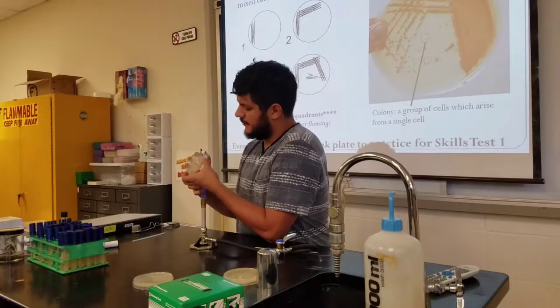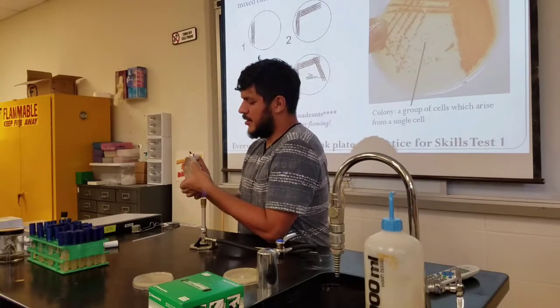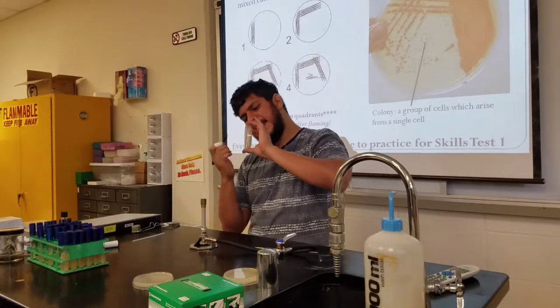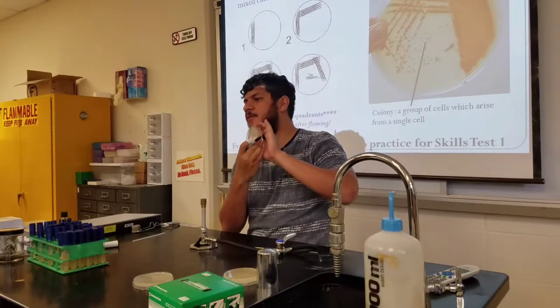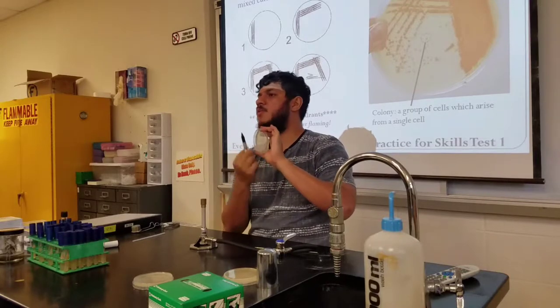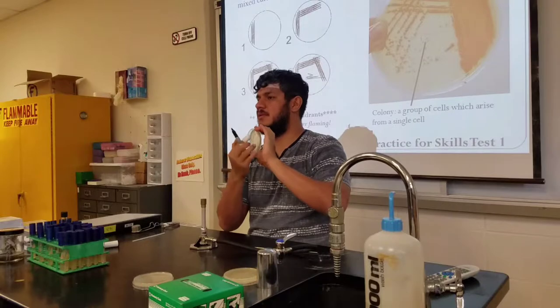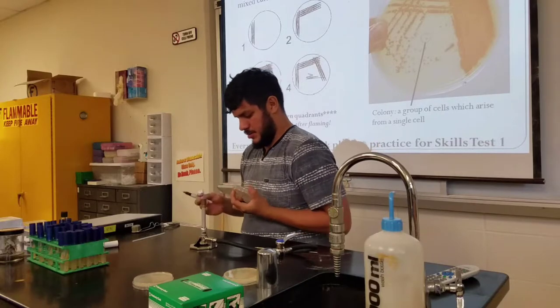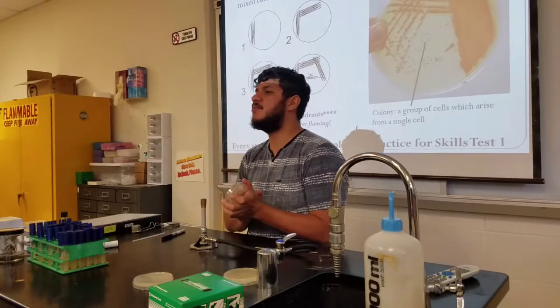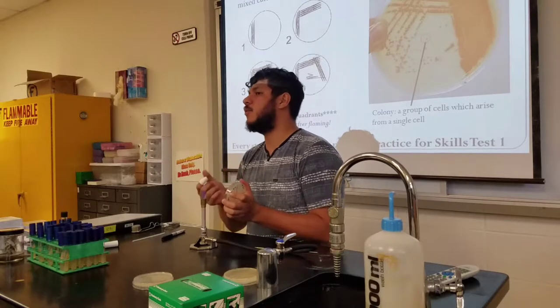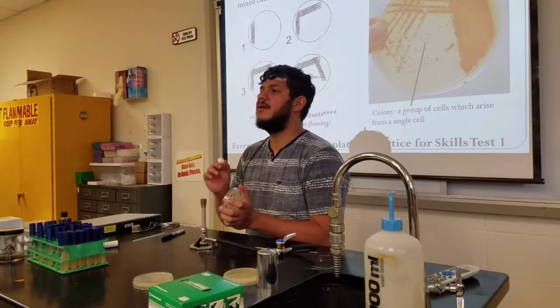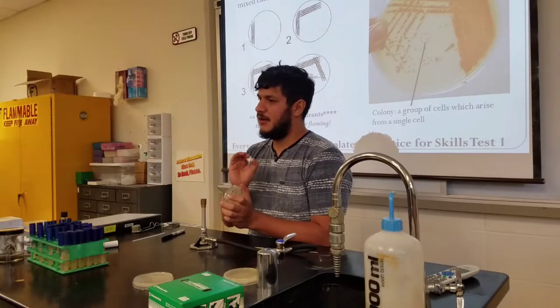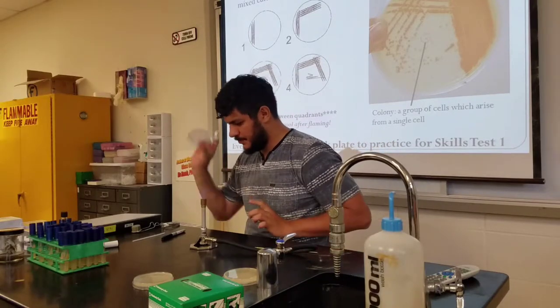Now, if you notice, it doesn't matter where I move this lid — the label stays in place. If I label the lid and rotate it, the label will rotate as well, and we won't know which position is the correct one. Furthermore, if we label the lid, the lid can be separated from whatever is inside, and if we're working with a pathogen that needs to be confined, separating that label from that petri dish could be very dangerous. So we keep the label where the agar is.